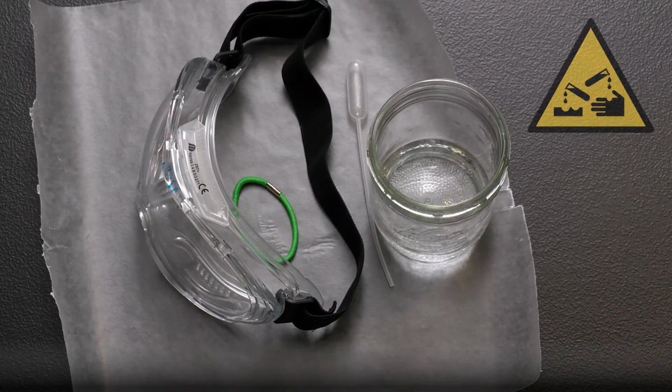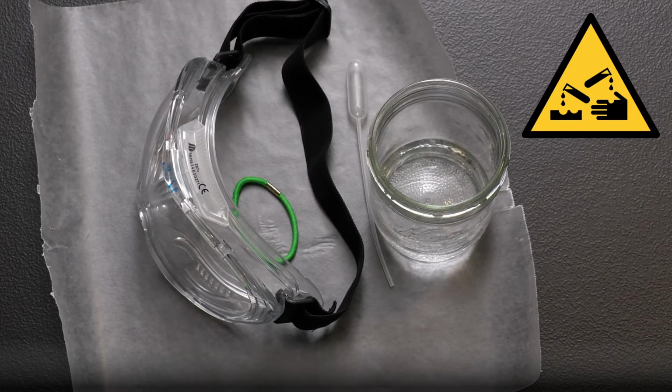It's important to be careful when working with acids or any chemical. Be sure to pull any long hair back, wear safety goggles, and avoid getting any on your skin or in your eyes. If this does happen, run your skin under water or flush your eyes with water for a few minutes and seek medical care. Be sure to store hydrochloric acid in a cool, dry, and well-ventilated area away from children.